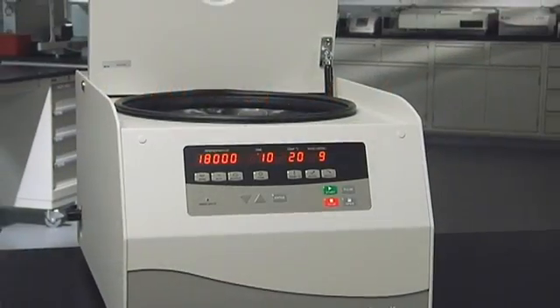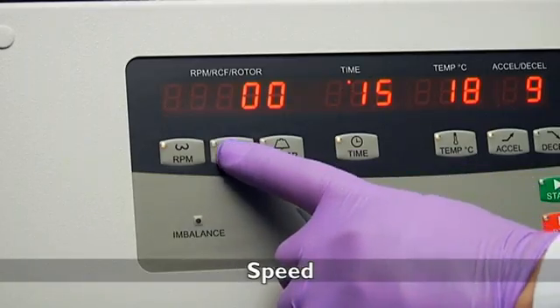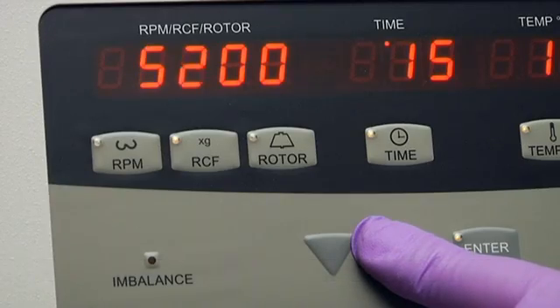The display is clear so you always know where your samples are in the process. With a simple press of a button you can easily adjust speed up to 18,000 RPM or RCF up to 30,000 times G, depending on the rotor you have selected.